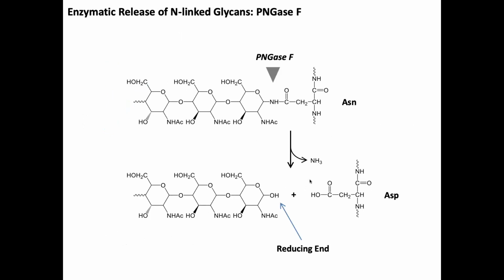If we go to this next one, okay, let me try to answer it here. I don't really have an answer for you exactly, other than it could be cost. So, for example, in proteomics, there's Lys-C and there's trypsin. Lys-C cleaves on the C-terminal side of lysines exclusively, and a lot of people use it. Trypsin does arginines and lysines. And you're like, why the heck wouldn't we use Lys-C? That doesn't make any sense. It's because Lys-C is like 10 times more expensive at least.